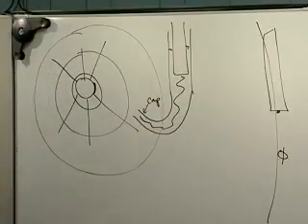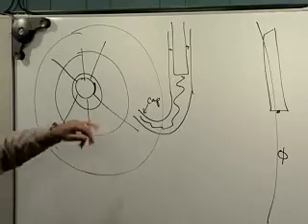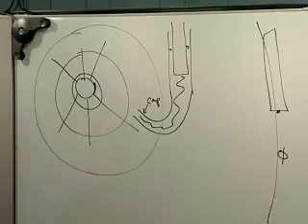This is lots of fun if you like it. It's one of the simpler things you can do in glass blowing, so really fulfilling. If you're not good at glass blowing, try this one. Makes you feel real good. Pull out a capillary, bend it, and break it.